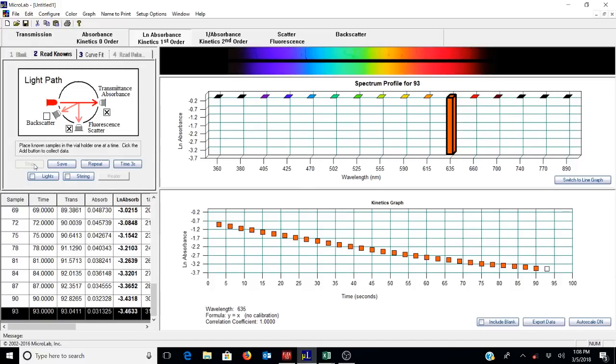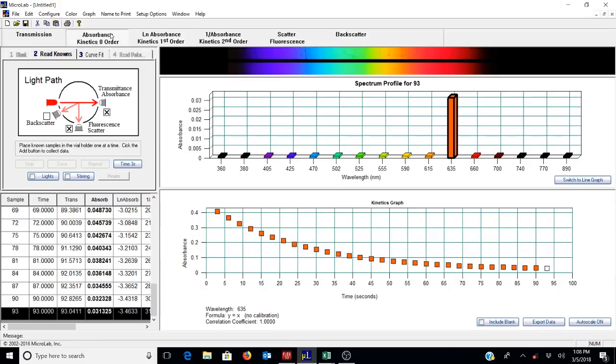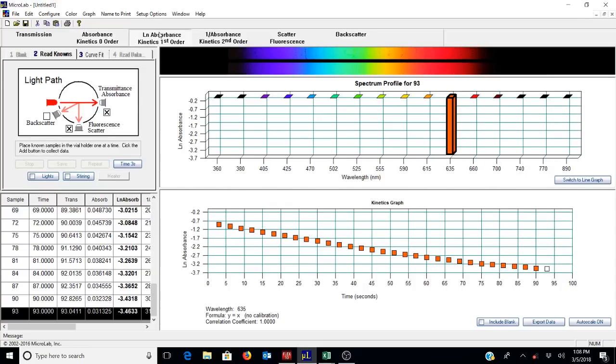we will finish our reaction. So if we just go over to the absorbance real quick and see where we ended up, we can see that we ended up kind of low. So we might have to unselect some of our data points. But that'll be obvious when we go to our graph. If we go to our graph and our line stops appearing linear, then we know that we need to stop those things. So I'm going to go ahead and save that data.